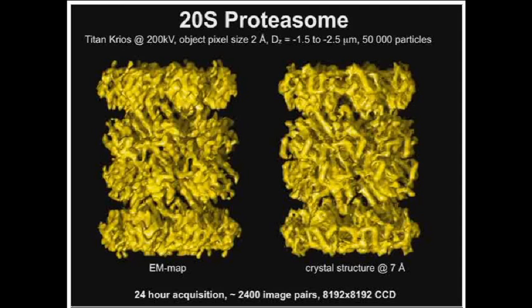And the goal is to have a contamination rate, and you can only say approximately, I can't give you real numbers, of 0.2 nanometers per hour. That's acceptable. Then you can operate a microscope on one sample for 3 days. And it's different if you operate a microscope in a high throughput fashion, where you collect 2,000 images and do all the alignment steps with the focusing and tracking and so on, or if you just collect one image in the morning, one in the afternoon, and one in the evening. If you don't do anything with the microscope, you do not create any vapor arising from your sample, so you don't create any contaminants. You create contaminants from the outside, which build up, but not as much as when you operate a microscope in a high throughput fashion.